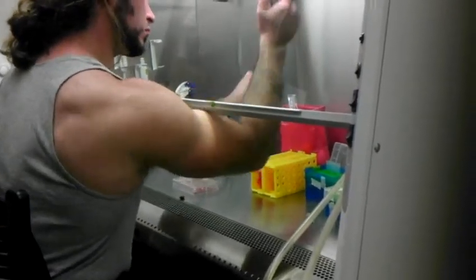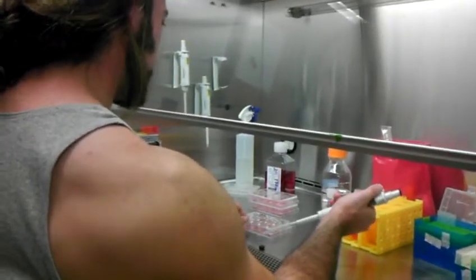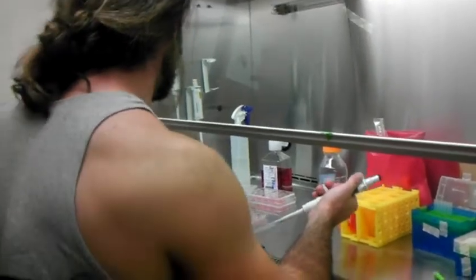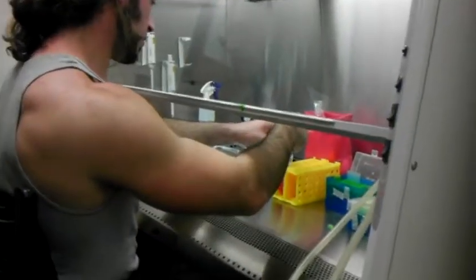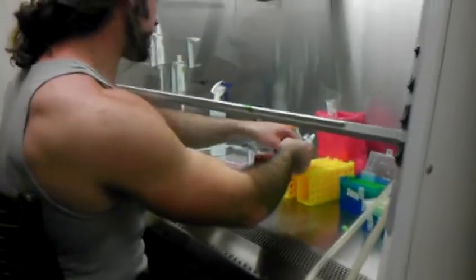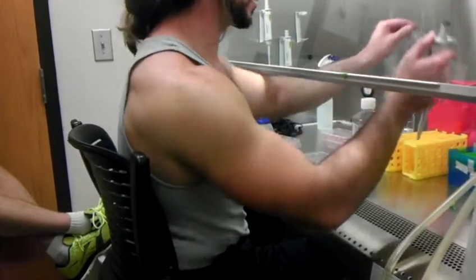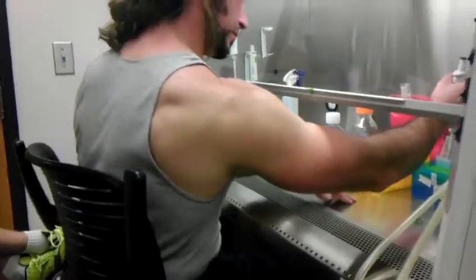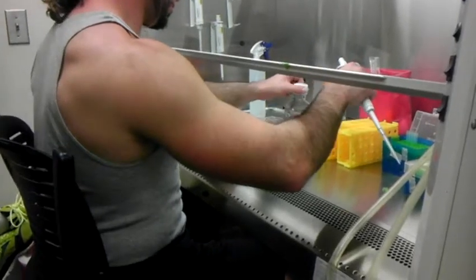You can grab a new pipette tip right now. I want you to do 3 sets of transfection media into 1 well. So 2400 microliters of transfection media into just one of those wells. This is the transfection media? The other one, the pure transfection media. Okay, the DMEM. How much did you say? Three bouts of 800. Each one gets 3 shots of 800? Just 1 well. Pick your favorite well, and put 2400 microliters of DMEM into that well.